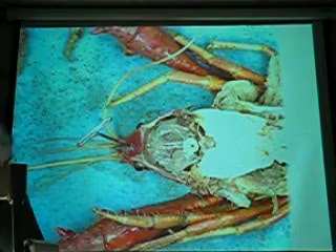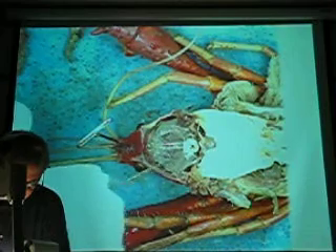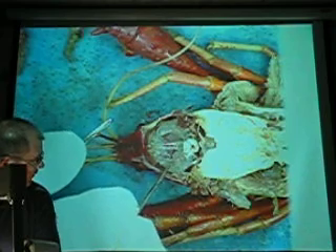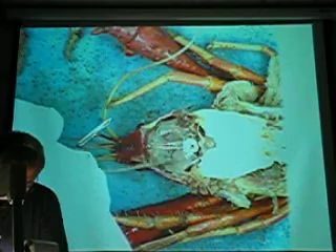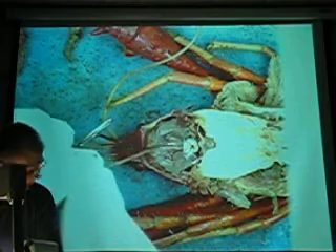That is what's called getting the light in the way. It's going to fit that dimension. Right... there. What is that? It's going to come out. Oh no! It's got a membrane right in front of it. Antenal gland? That is the antenal gland. There's another one right there. But there's a membrane and a block in it.